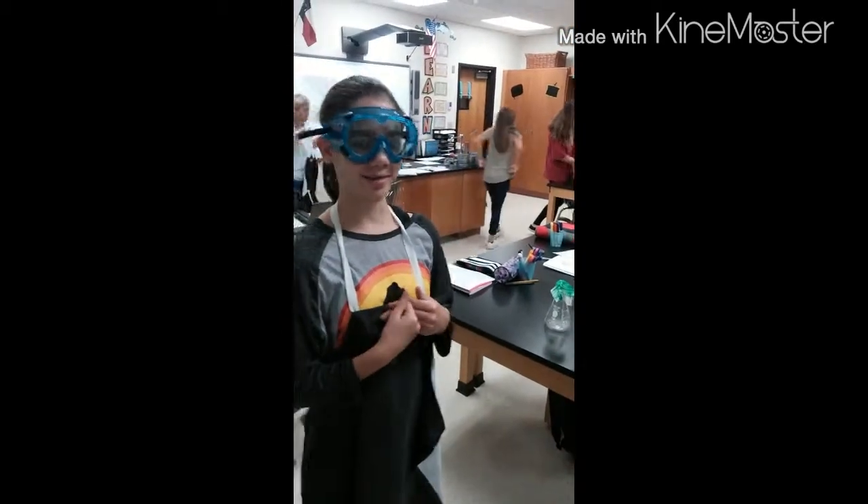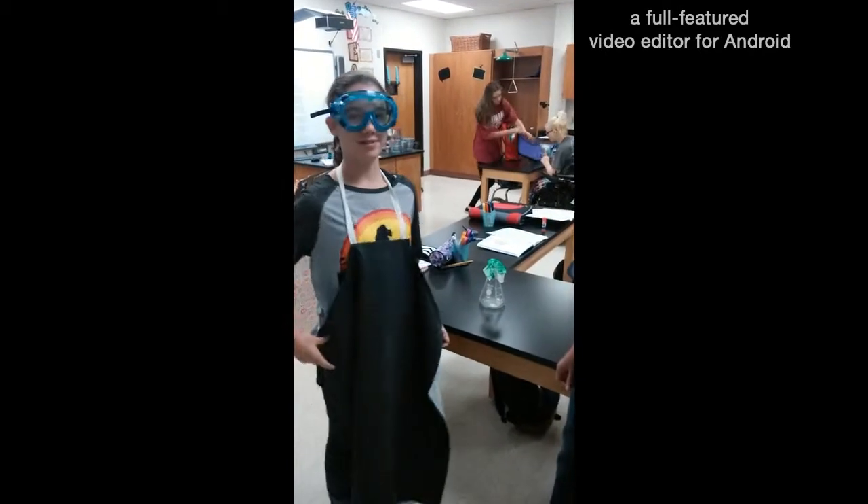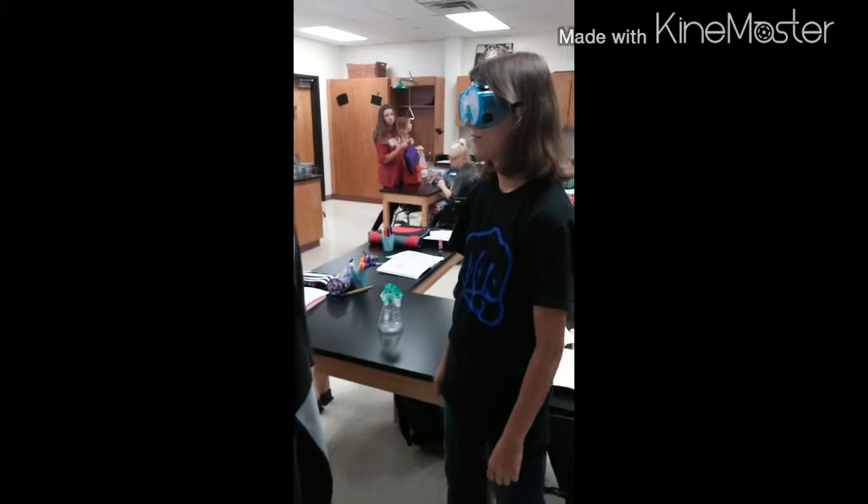Okay, so we are here to document our lab safety plan. We are going to put our hair up and have an apron on — which we don't have one. I don't even have one.